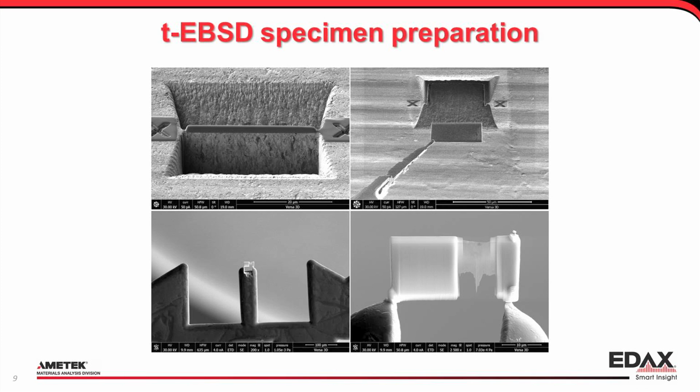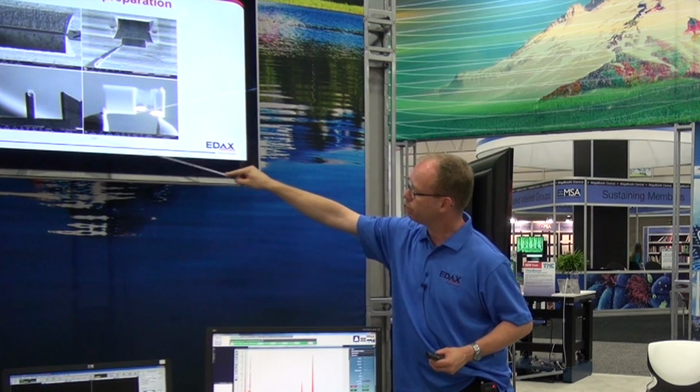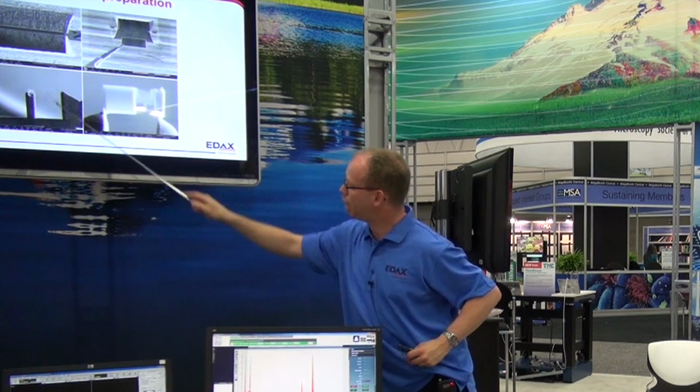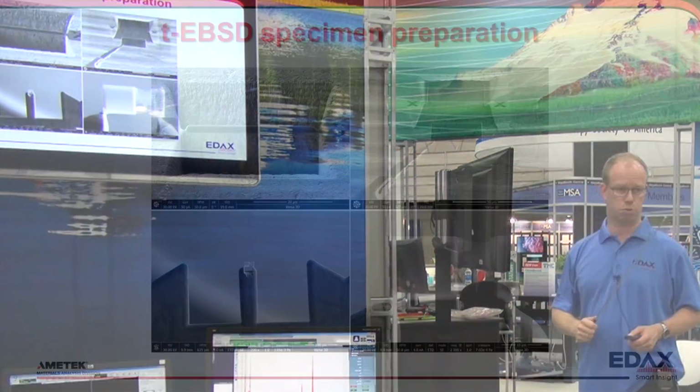Of course, there are many different ways to prepare TEM samples. The example I have here is a FIB lift out. So you just take the normal routines, put a protective platinum layer on top. You mill the lamellae, you mount it on the stub or on the holder. This is a copper, one of these half moon grids where you just solder it on with platinum, and then you thin it further until you have it electron transparent.